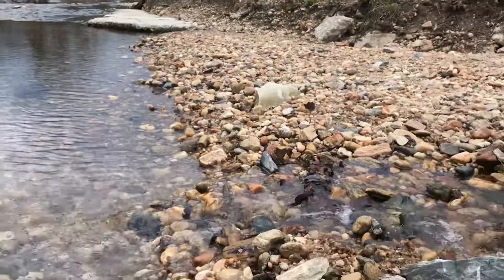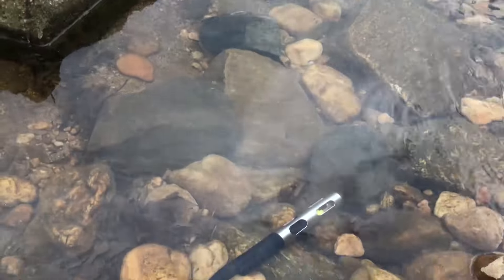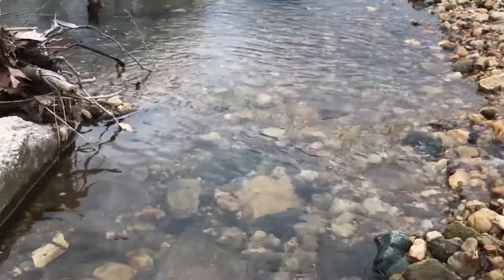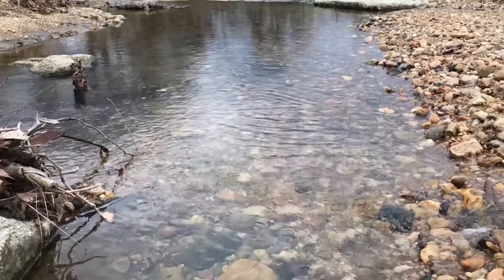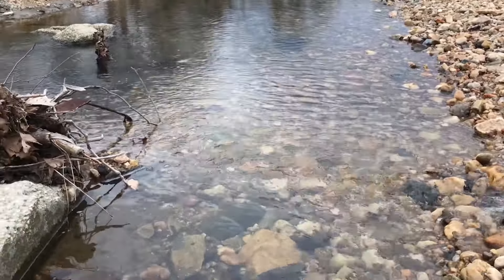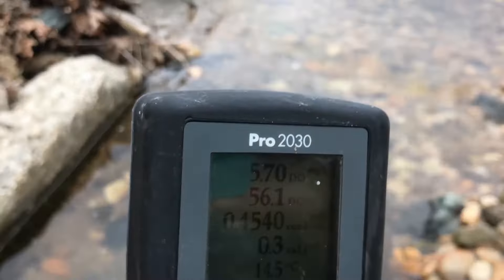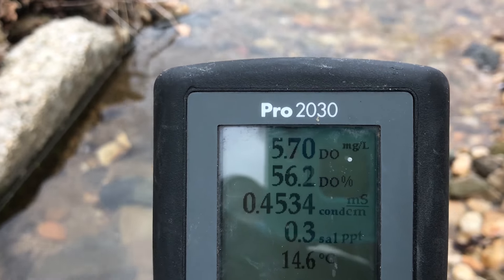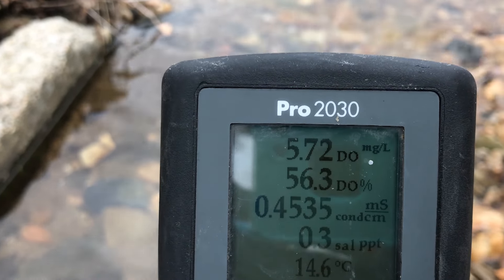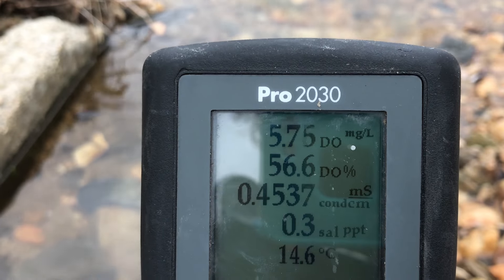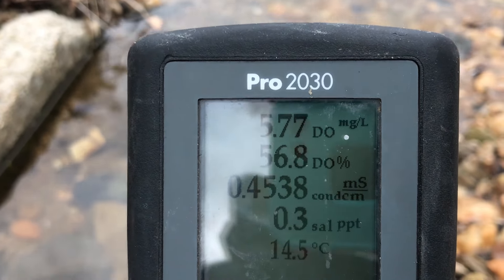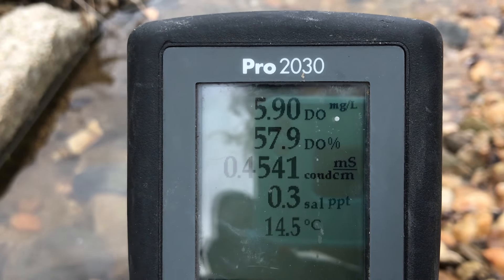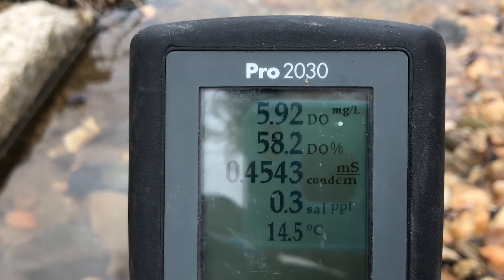Here's our beautiful bubbling stream. I've put the probe into the water close to those ripples but not directly in them. I thought our dissolved oxygen reading would be pretty high, but the Pro 2030 tells us otherwise — our dissolved oxygen level is actually 5.7, which is healthy but a little lower than I thought it would be in such a moving-water stream. You can also see the temperature of the water there: 14.5 degrees Celsius, so it's still pretty chilly for early spring.